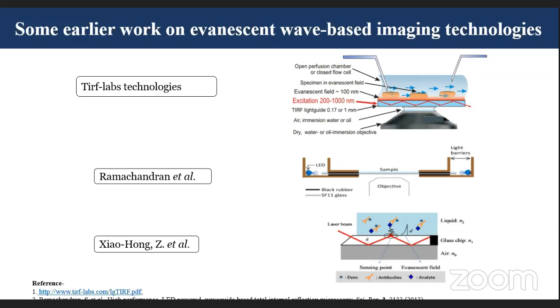But the immersion oil and the glass slab have to have different refractive indices. Otherwise, the ray will emerge out into the immersion oil. So they used a coating material, and this setup generates a good total internal reflection. However, it's difficult to use in general. It is a very specific setup for a specific experiment.